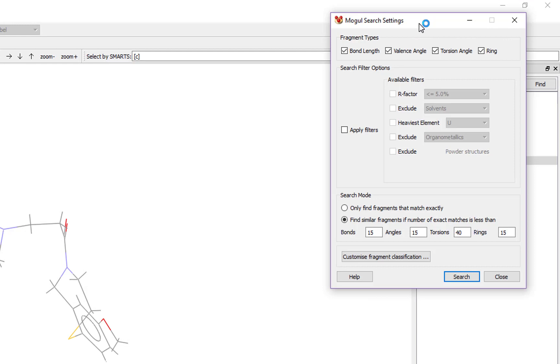A dialog box appears which allows us to change settings for the search. Here you can see fragment types are given as bond length, valence angle, torsion angle, and ring. In the interest of time, we will untick the box by ring.